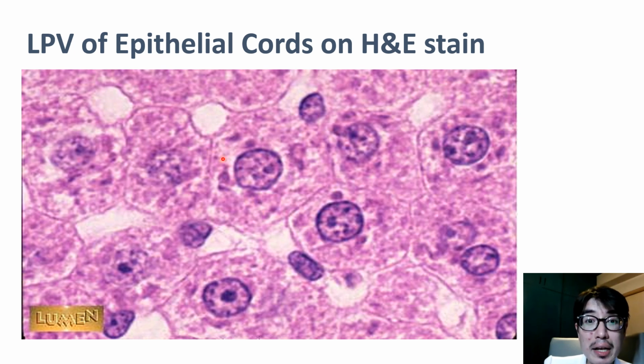Different cells take different shapes. These are, for example, epithelial cords of block-like cells. As always, the nucleoli and the nuclear heterochromatin stain darkly with the hematoxylin, while the cytoplasm is eosinophilic, staining highly with eosin.